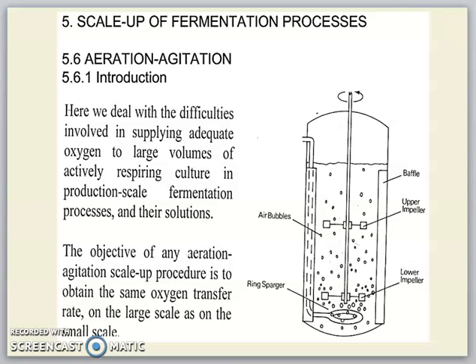For aeration and agitation, we may face difficulties involving the supplying of oxygen, if it is an aerobic bacteria, to the large volume of actively respiring culture of aerobic bacteria for the production. So the objective of any aeration and agitation scale-up procedure is to obtain the same oxygen transfer rate on the large scale as on the small scale.